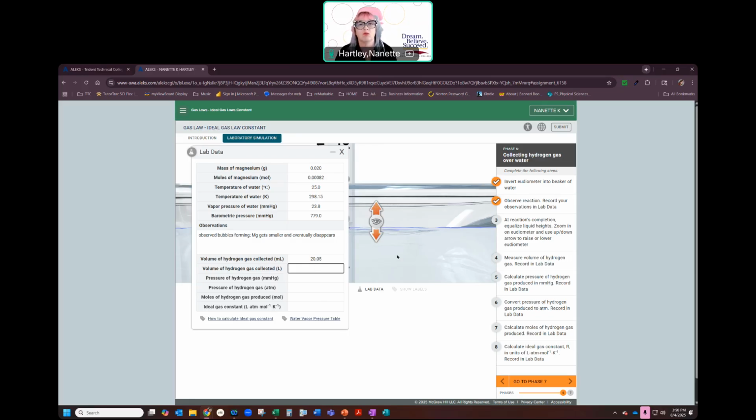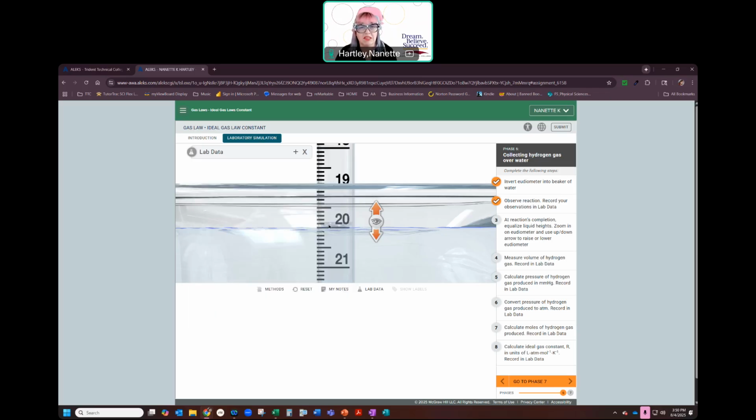Okay, so that's where we're at. So that's the number that we're recording for now. And again, the way that I did that was to raise this so that the meniscus and the line are even. And I'm doing the best I can to read where that is. It's very difficult to do because it's hard to tell where the meniscus actually is, where that line actually is, because the way that they've done this with the shadowing makes it very hard to see. Okay, so we'll see how that goes.